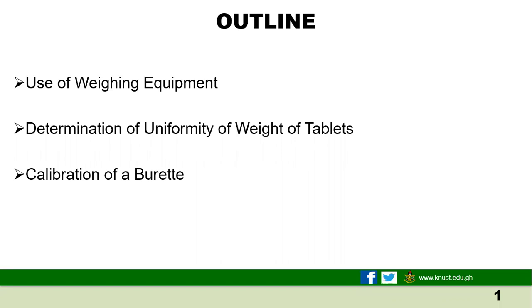Now we are making these set of videos to throw more light on the labs that we have been doing so that we can adequately prepare for our lab exams. Now, this is week 2, and we are learning the use of weighing equipment. We are learning how to determine uniformity of weight of tablets, then calibration of burettes. Good.